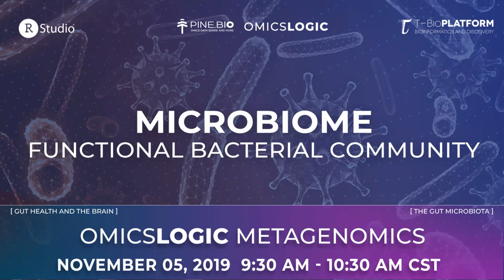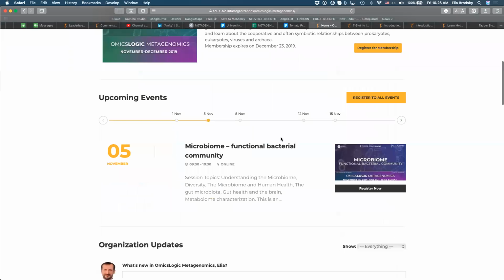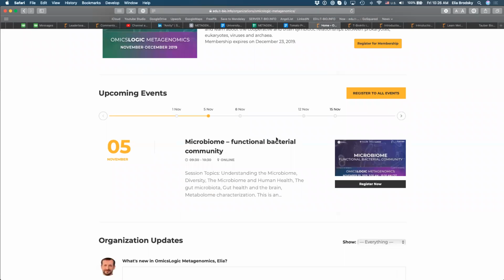And we'll also start talking about an example where we can look at how diverse gut microbiome is. This will give us insight into how we can leverage some of these techniques to analyze different types of data and study the microbiome, but also just to use microbiome as a means that will be important in the future aspects of our discussion. So next session will be focused on the microbiome.